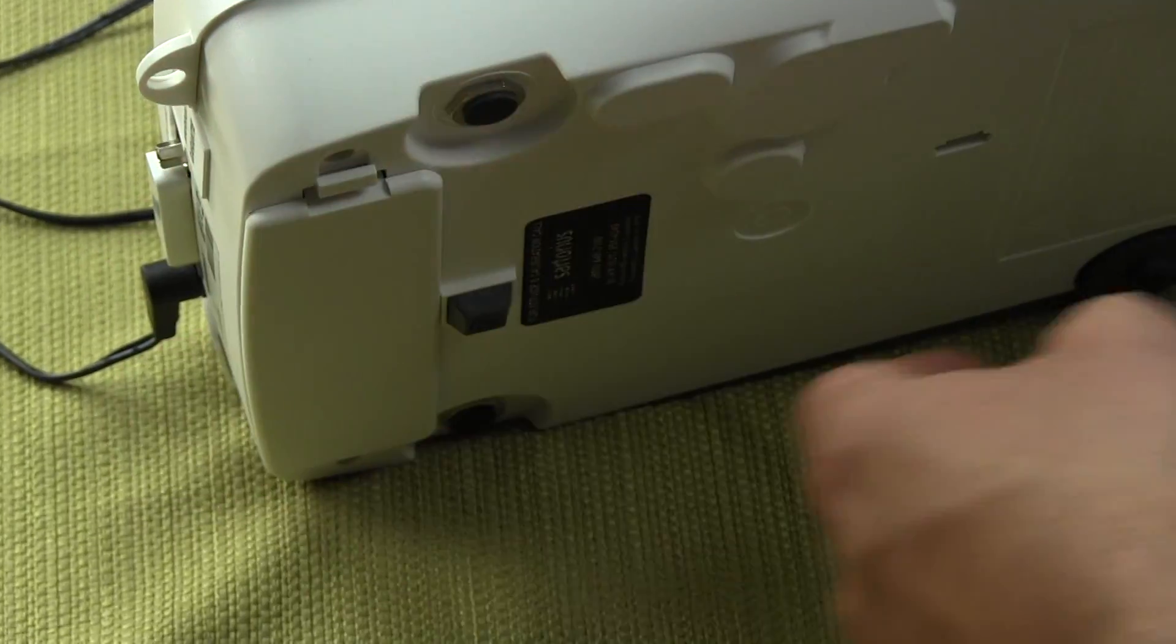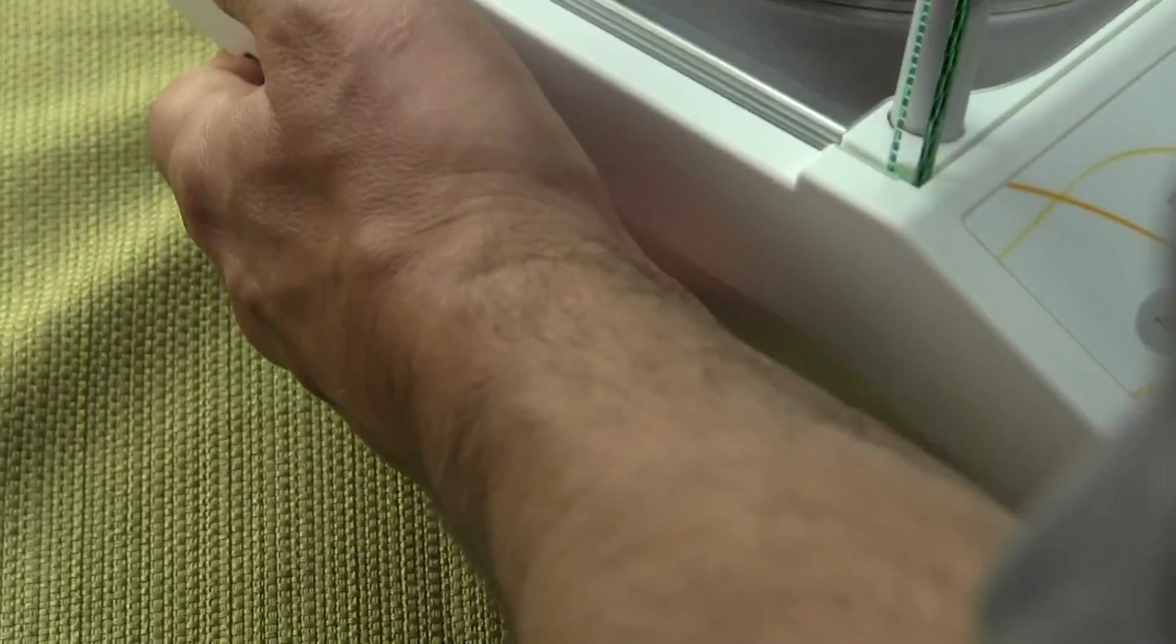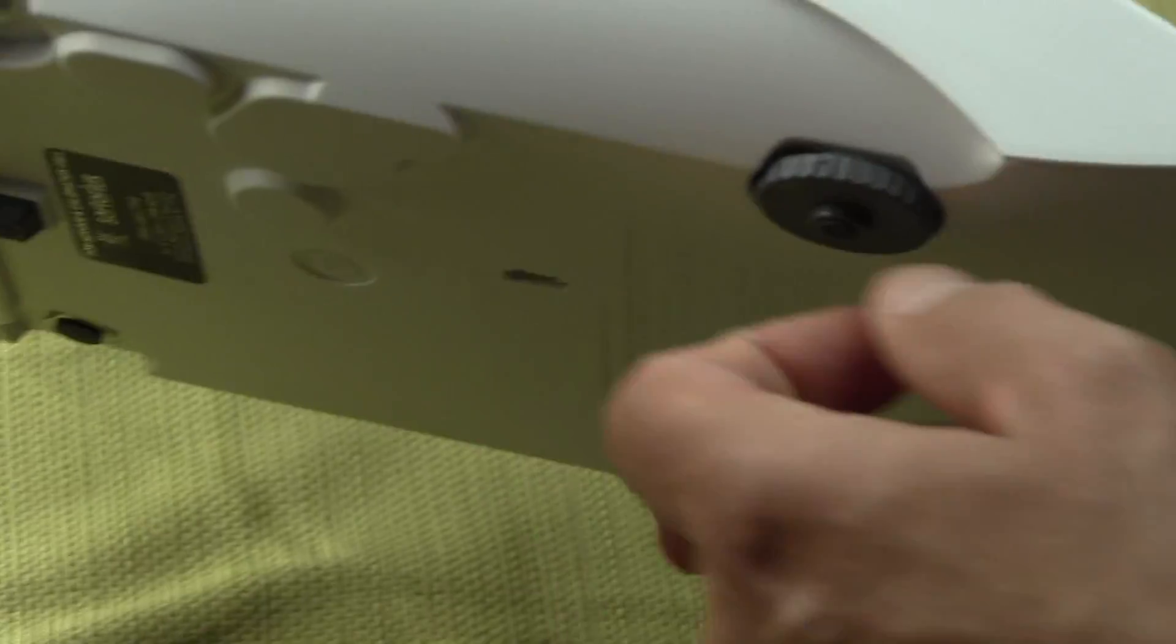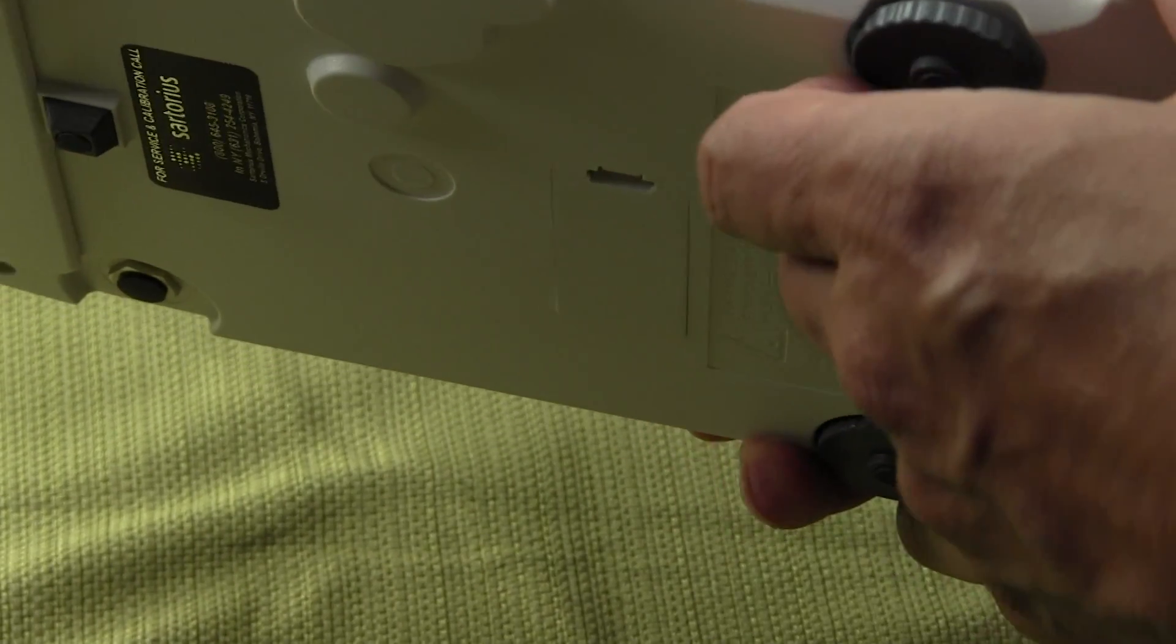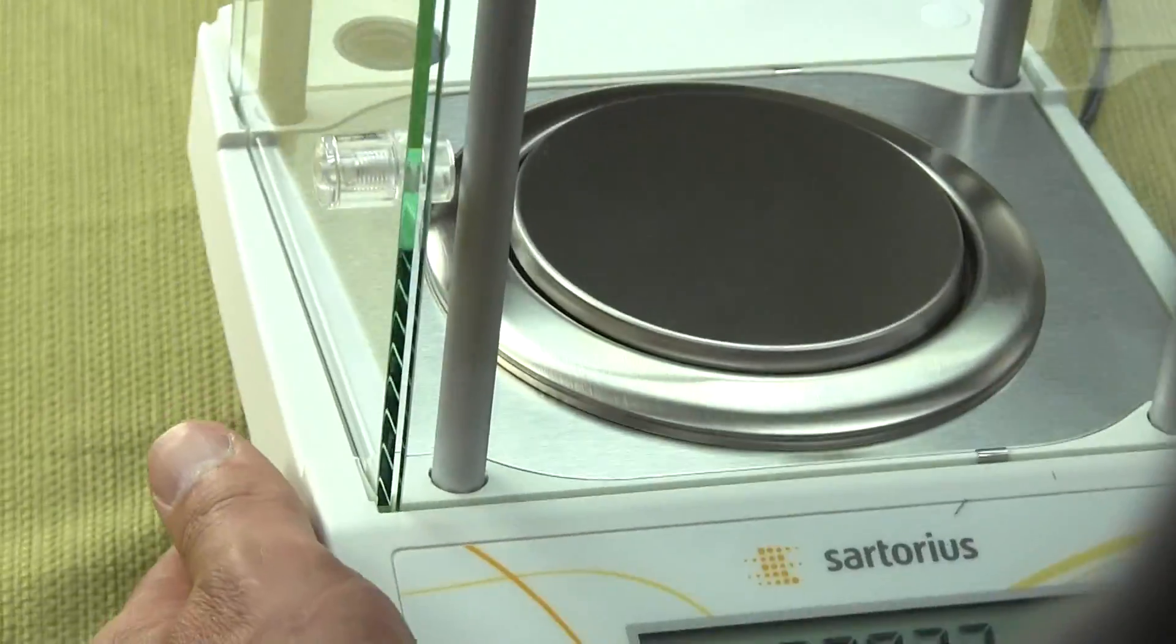On the bottom of the balance, you have basically, I don't want to break this, but you have two adjustable feet on the bottom of the balance. So here's one adjustable foot and the other one on the other side. There is no weigh-below hook. Again, this is Sartorius' economy version.